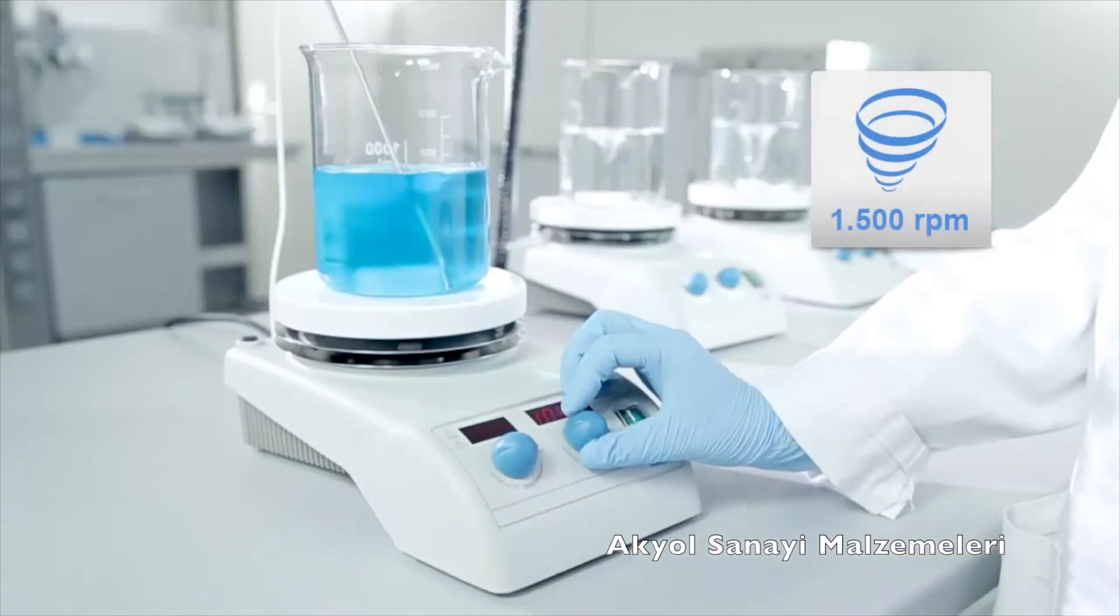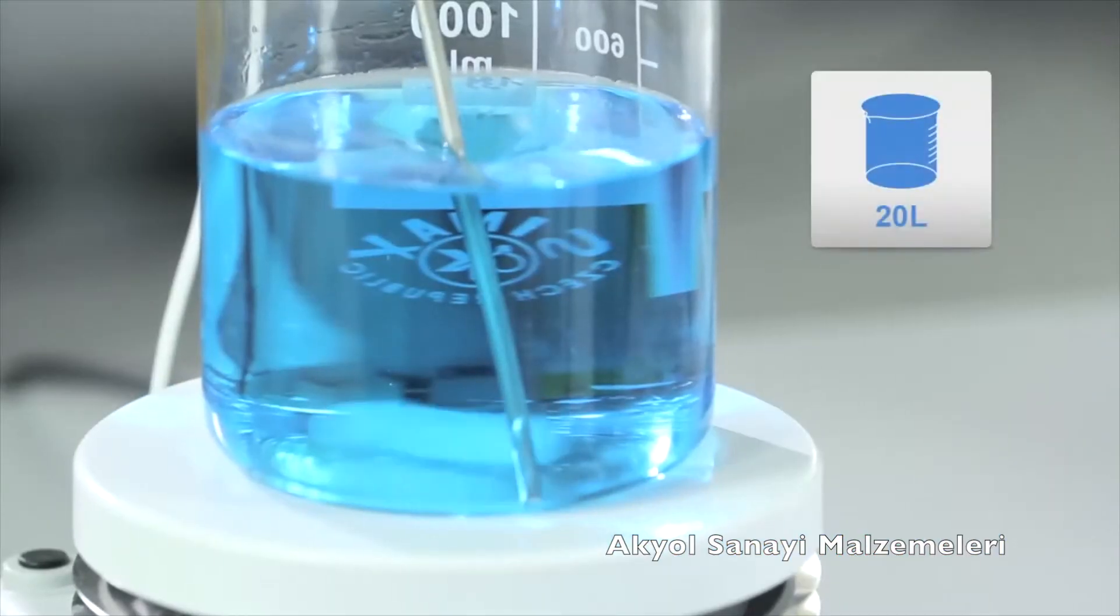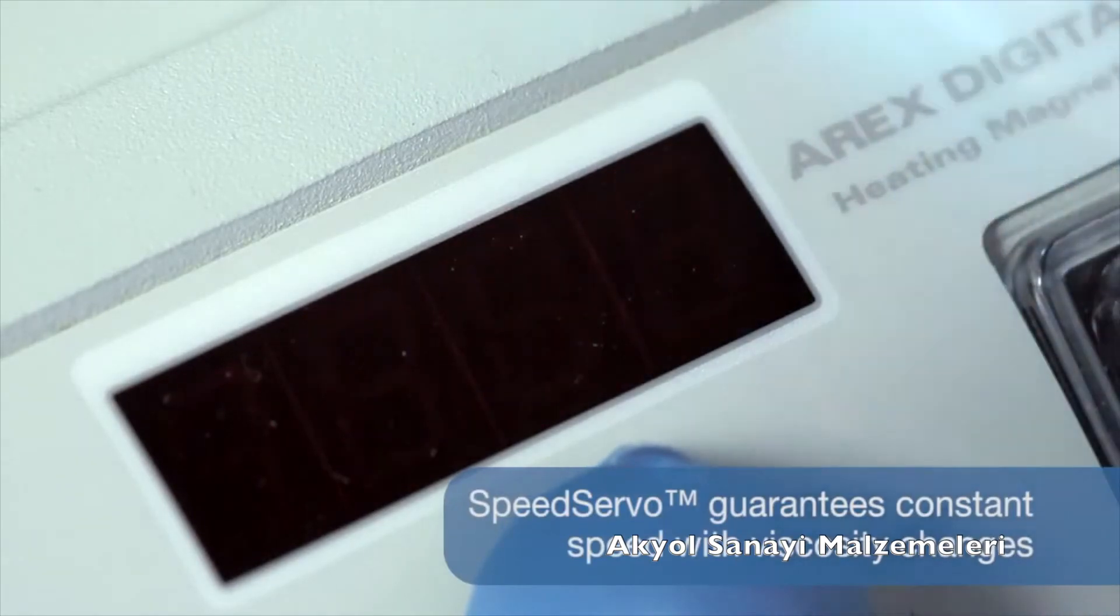Advanced technology, excellent temperature homogeneity, and fast heating bring this stirrer up to the highest level. Speed Servo automatically ensures exact speed under changing load.